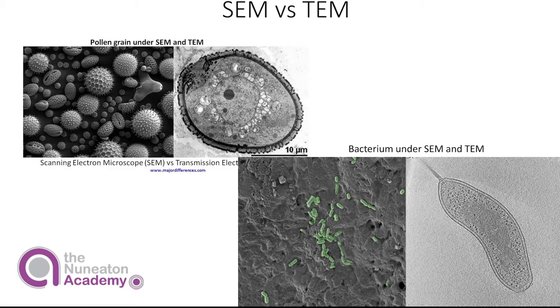In our bacterium, we can clearly see that there is a flagellum and other internal structures. So it's very cool to see these incredibly zoomed in, magnified images. And electron microscopes can magnify up to 10 million times the actual image size. So it's very cool to see images that our naked eye would definitely miss.